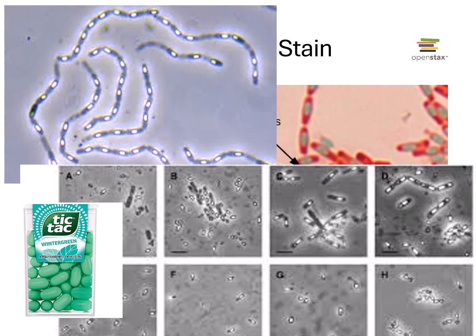A faster way to identify if endospores are present is often through phase contrast microscopy. And you can see some images here. If you do phase contrast, you'll be able to see that the endospores really stand out. They're kind of like a white, almost like a Tic Tac candy, if you've seen Tic Tacs before. And I can see them over here as well.